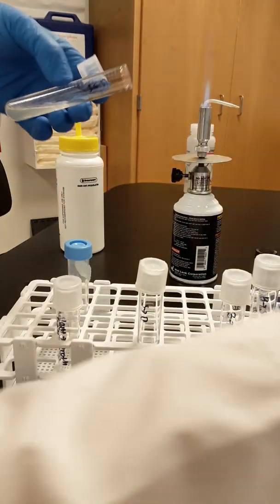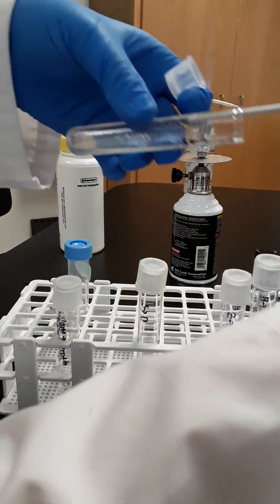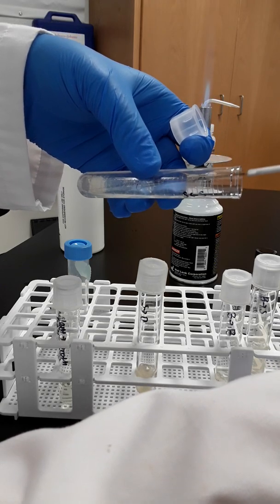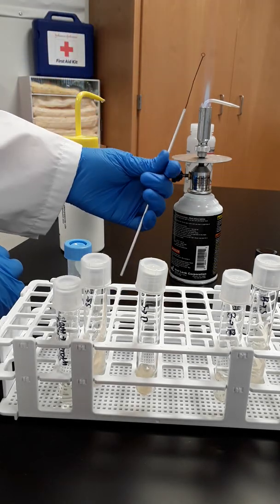And then for the slant, you're going to insert this all the way in. Flame, flame. You're going to insert this all the way in to the very base, and then you're going to make wiggles all the way up, where you're definitely touching the slant the entire way. Then you're going to flame it.